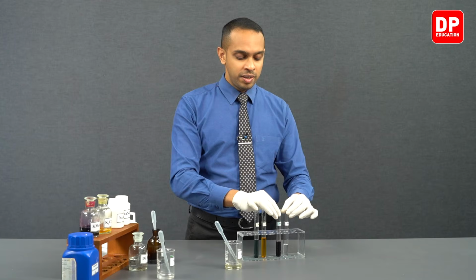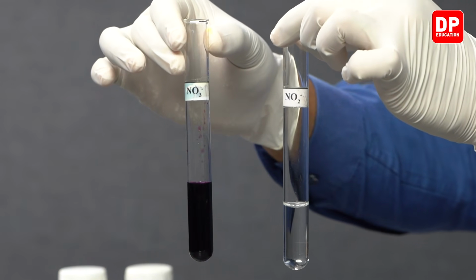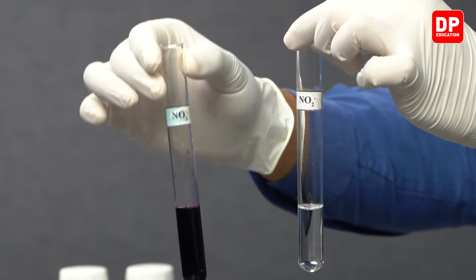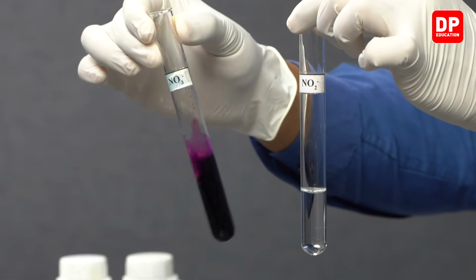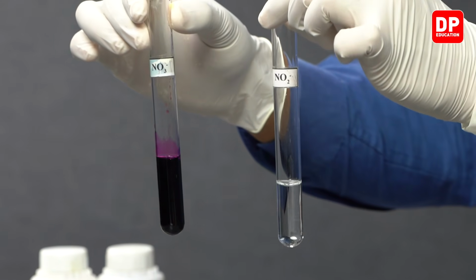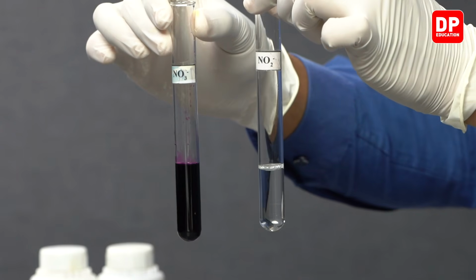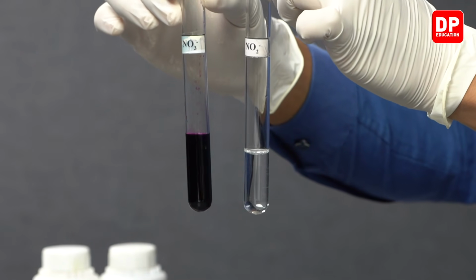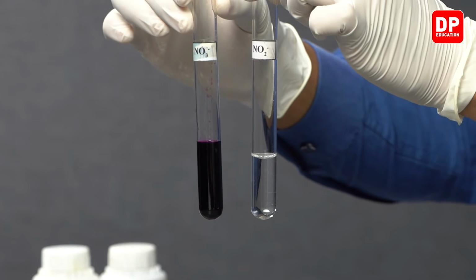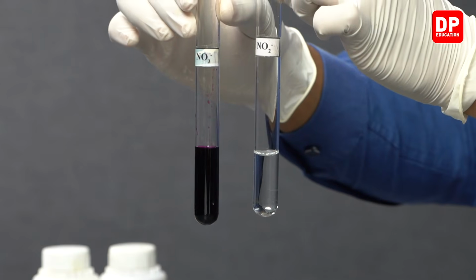Similarly, when we reacted acidified potassium permanganate with nitrate ions, we did not see any color change. It remained purple. However, when nitrite ions were reacted with acidified potassium permanganate, we observed how the color is changing. So purple color changed to a clear solution.